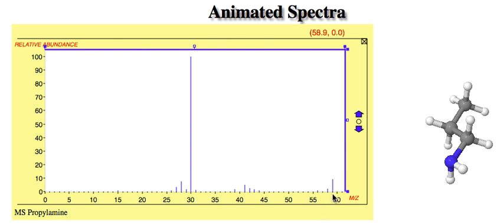And what this is indicative of is having nitrogen in the molecule. So here's our nitrogen. There would have been a hydrogen here, so we're missing 1, and we've got 2 coming back in. So just as in the degrees of unsaturation, we've picked up an extra hydrogen, 1 unit of mass. Nitrogen itself is 14 units of mass, but the extra hydrogen makes it odd. So if you find an odd molecular mass, it probably means you have a nitrogen in your molecule. This helps us to figure out the formula.